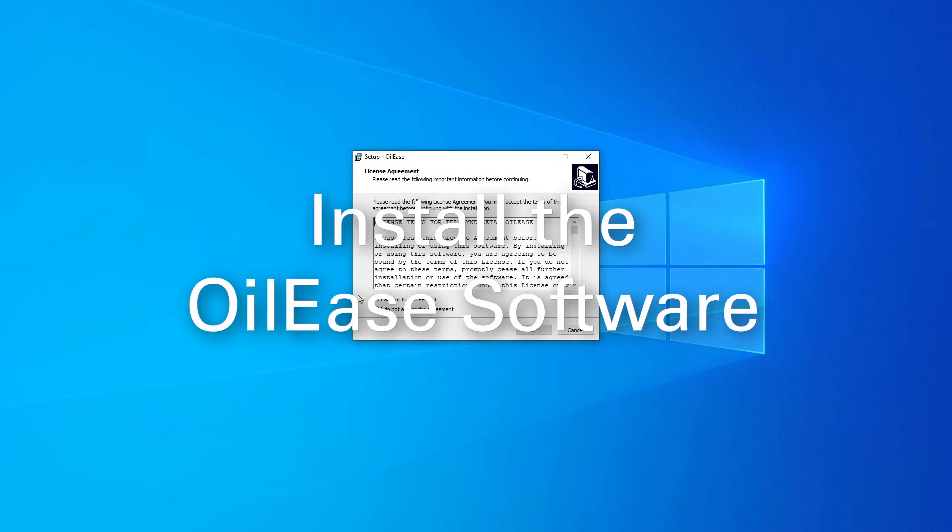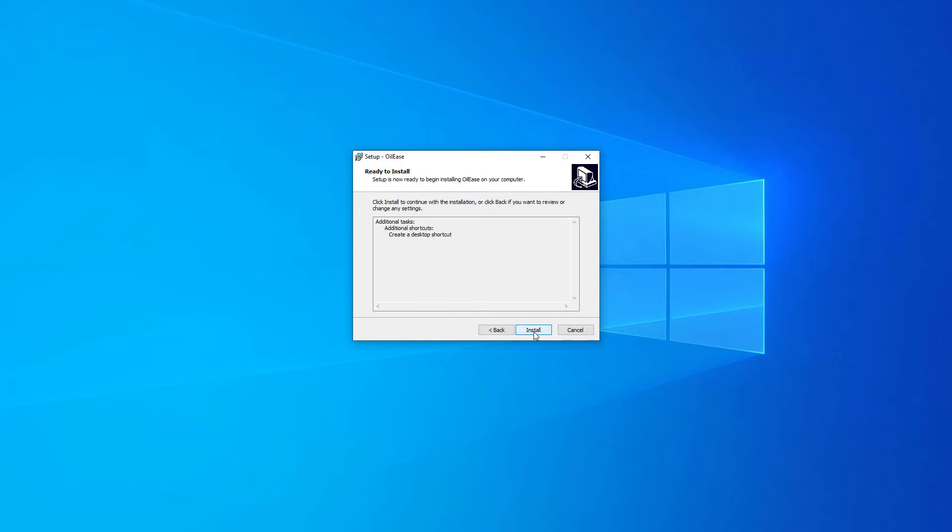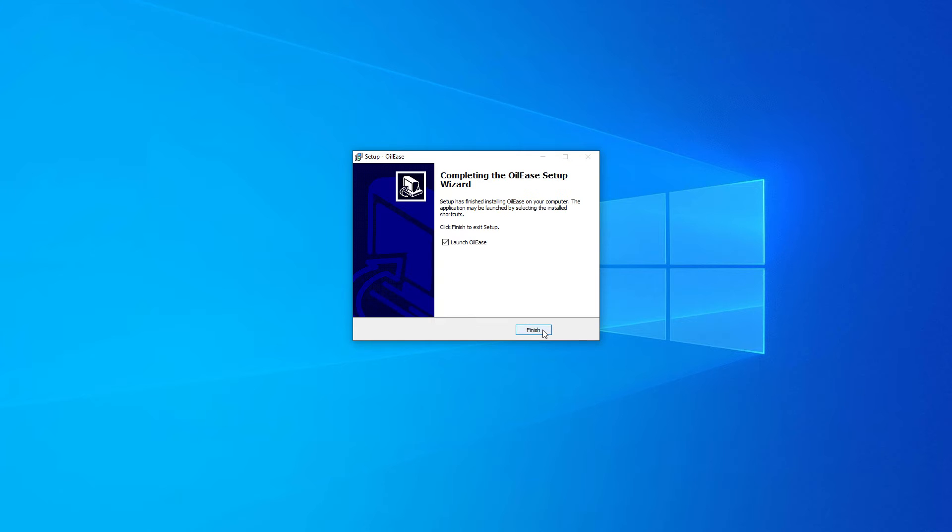Install the OilEase software from the included CD on your computer. Double-click the OilEase installation file and follow the prompts to complete the installation.